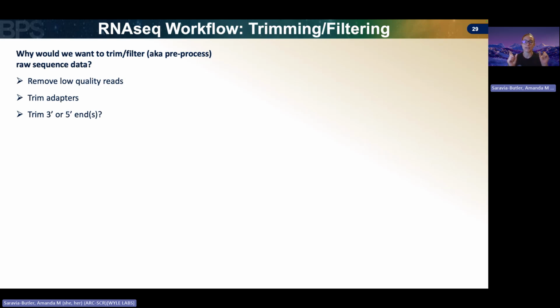And then also we see a 5' cap added on at the 5' end and a poly A tail added on at the 3' end. And so that poly A tail and 5' cap did not come from our DNA template, right? So when we go back to map to a reference genome, we wouldn't be seeing those pieces in our reference. And so another thing that you can do is, if you're detecting poly A's in your sequencing data, you can go ahead and chop those off in your trimming.